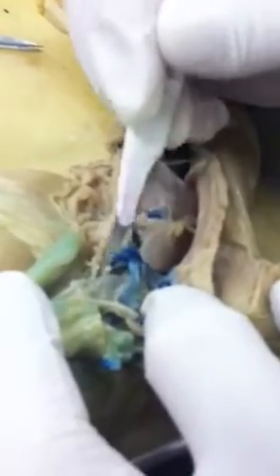So is this right here the thyroid then? Yeah, right here. Where? Okay. Hold on, let me zoom in. What is she touching? Right here. Right there. Kind of darker structure. That's a thyroid gland.